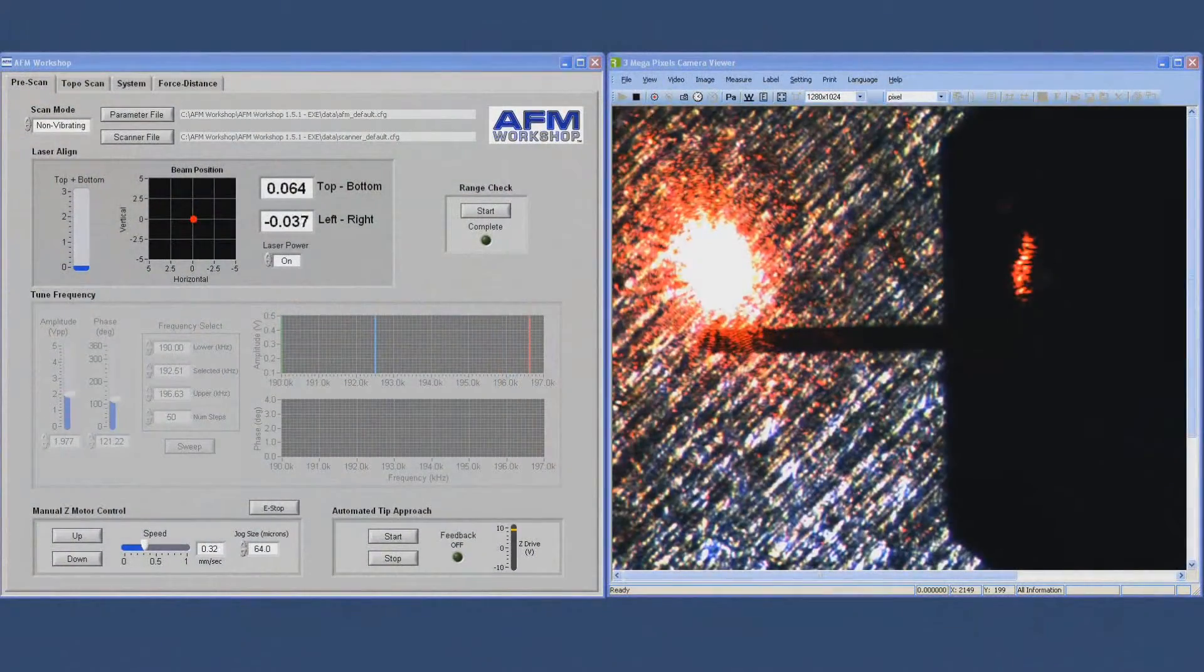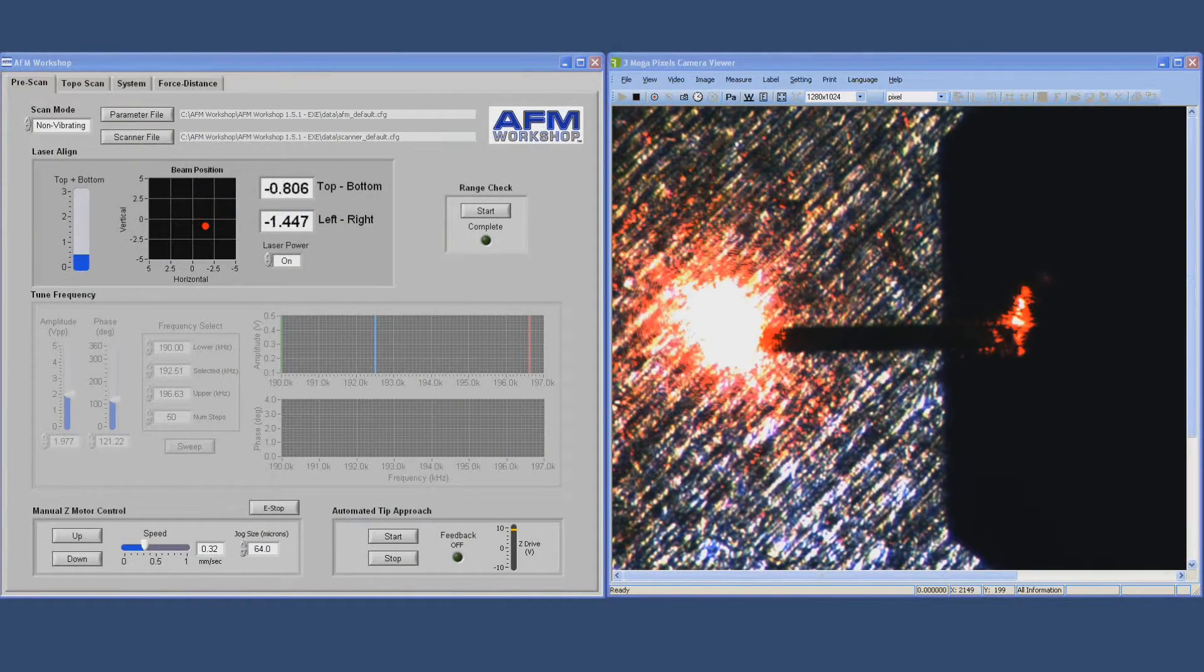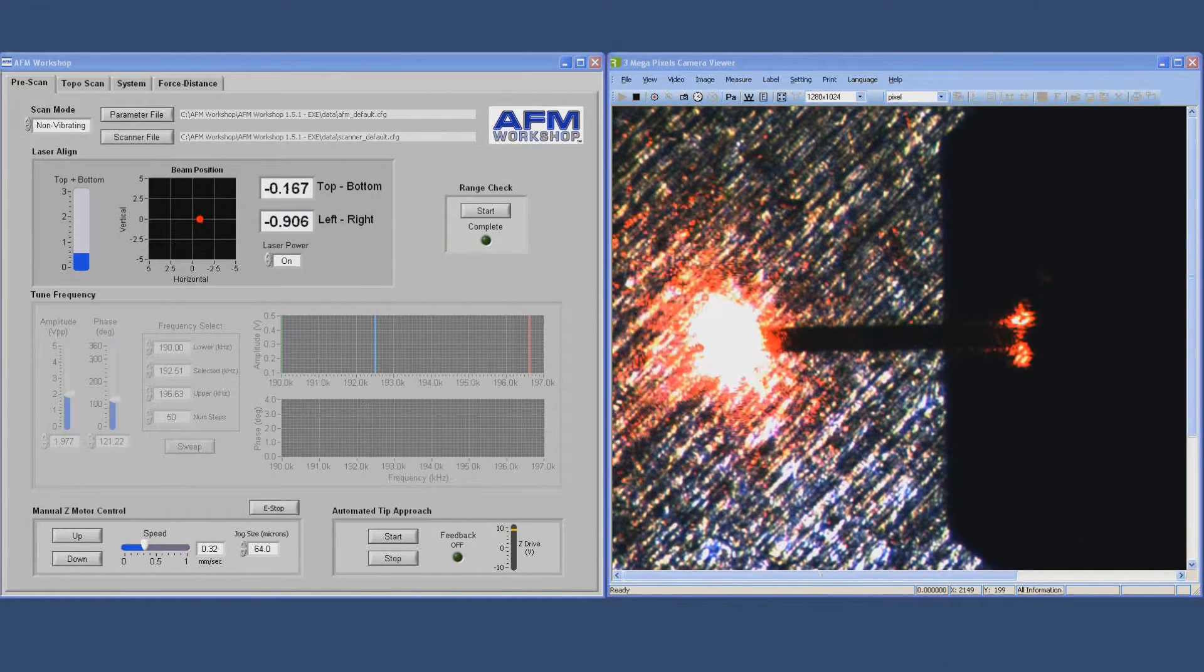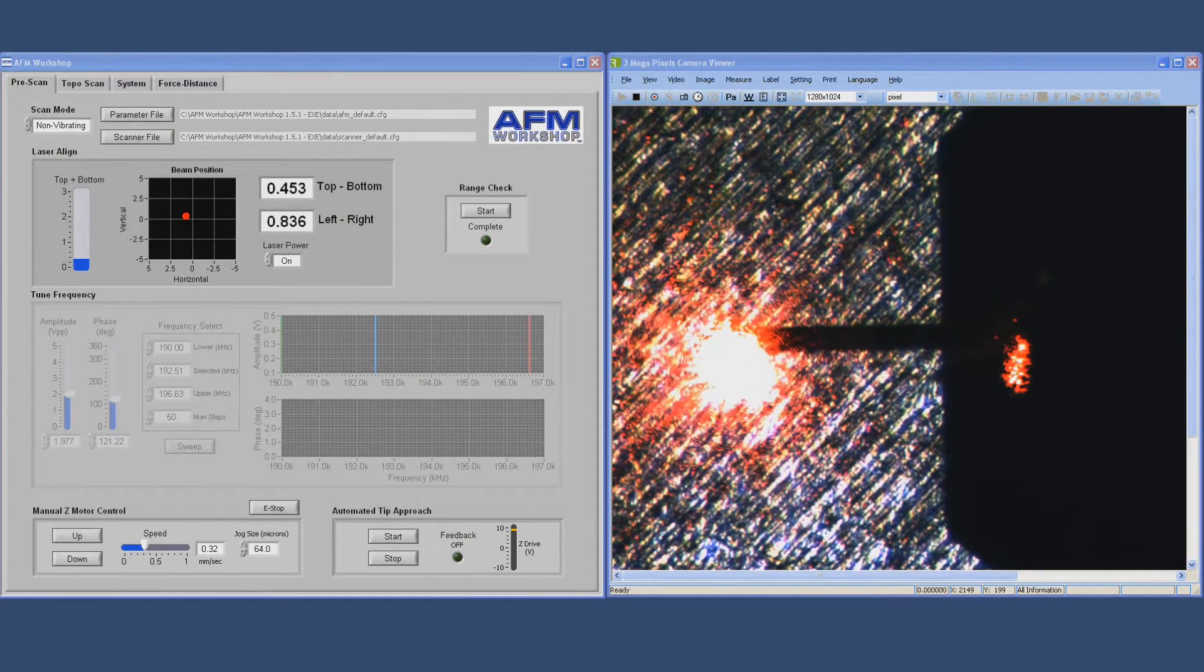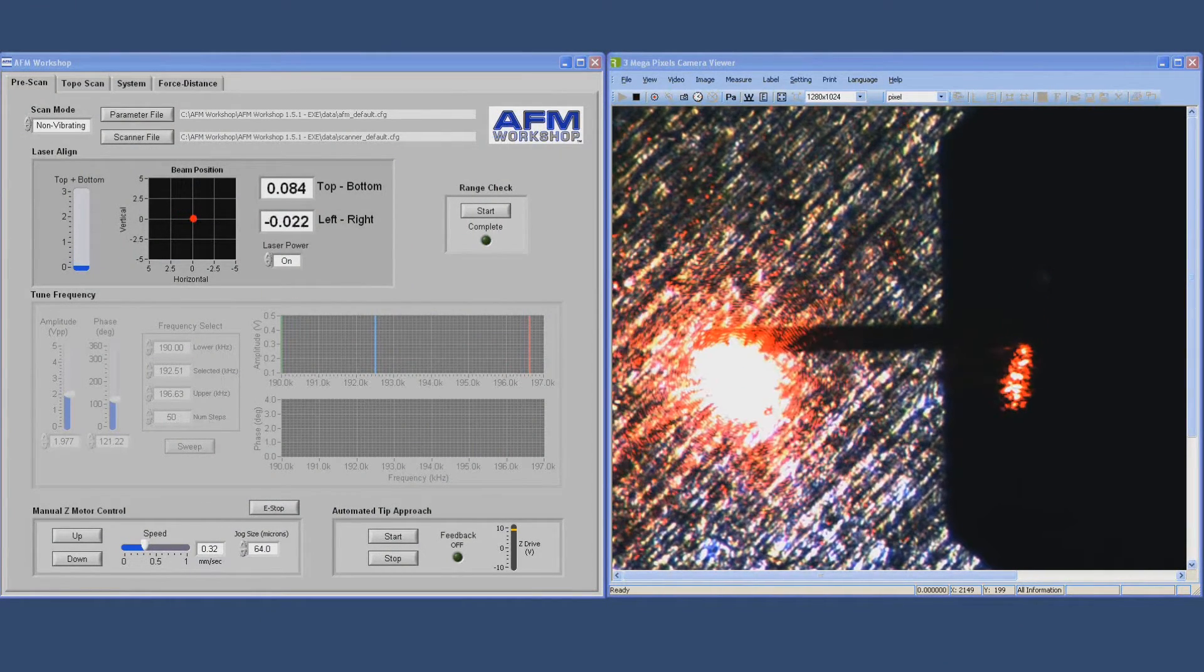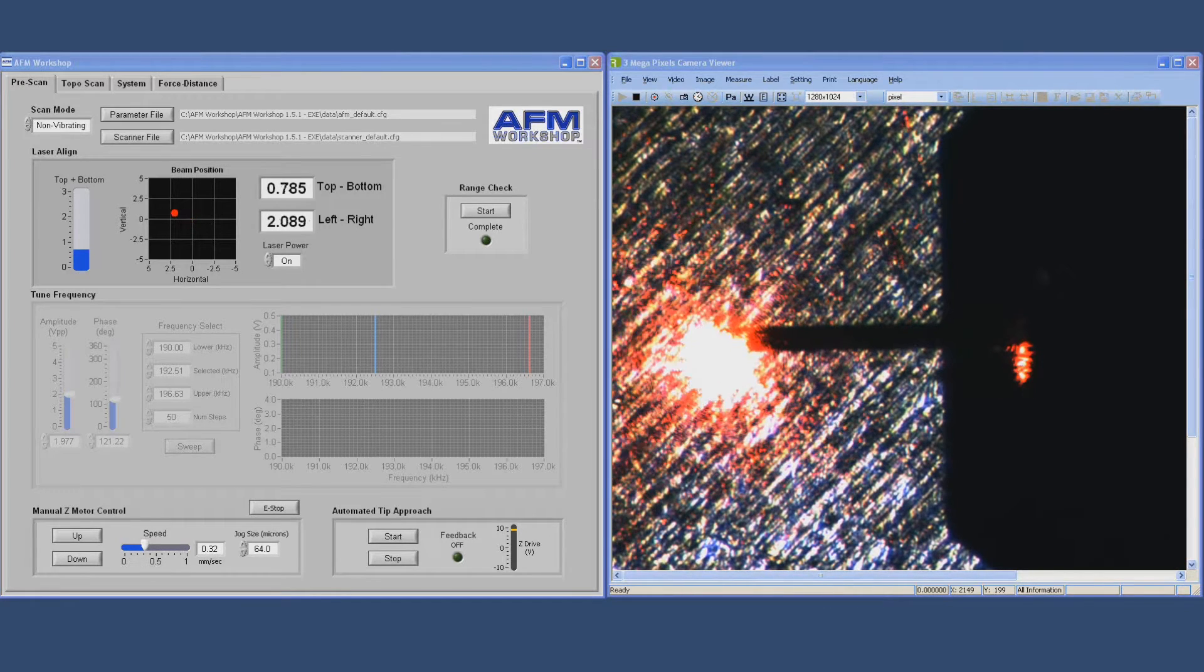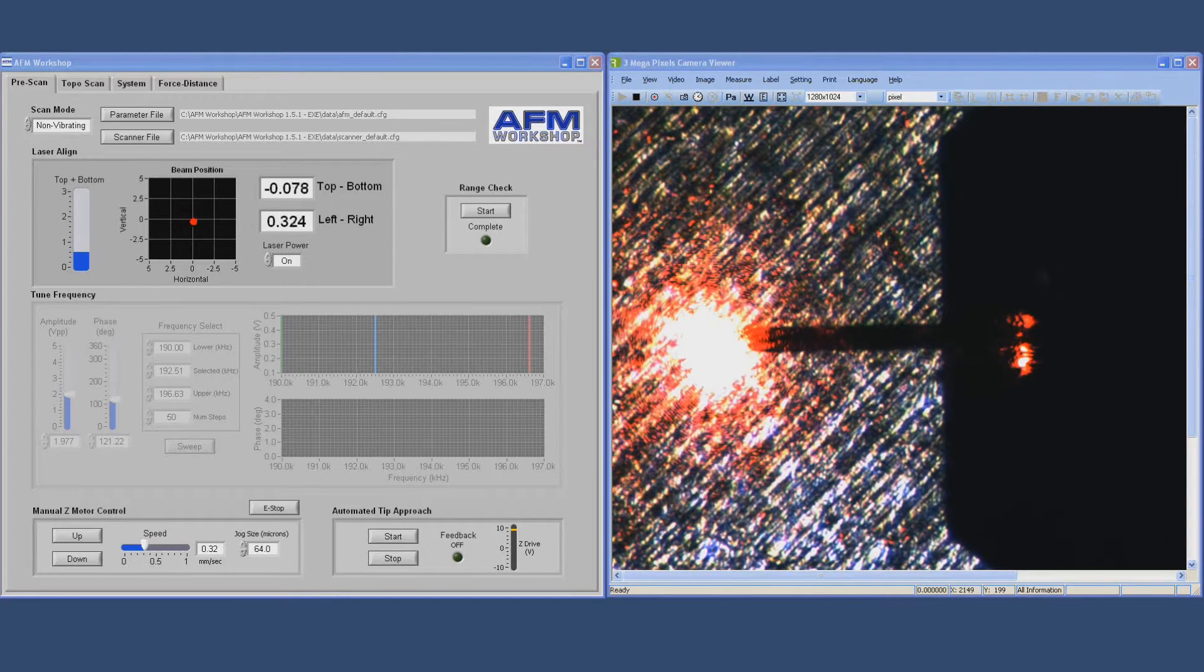The next step is to align the laser onto the cantilever so that you can get light into the photodetector. That's shown here. We're moving thumbscrews back and forth and you can see the red dot alignment is changing on the computer software screen.